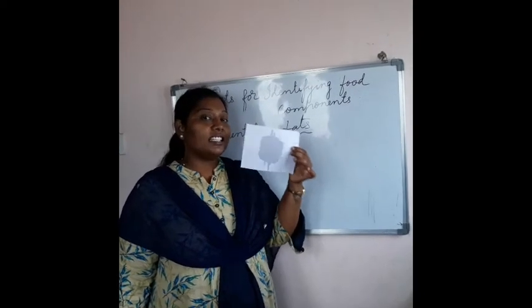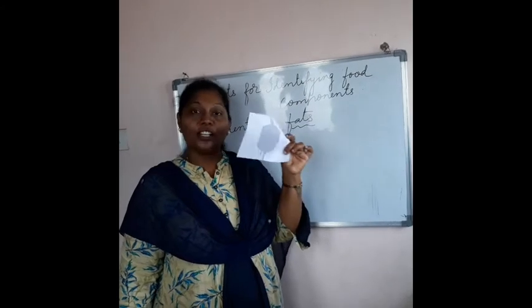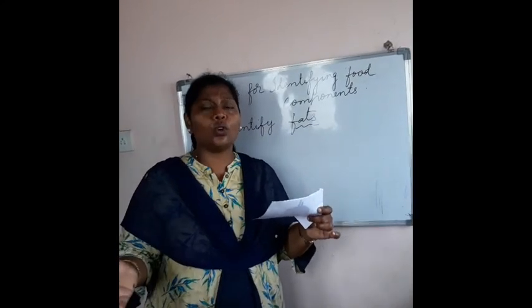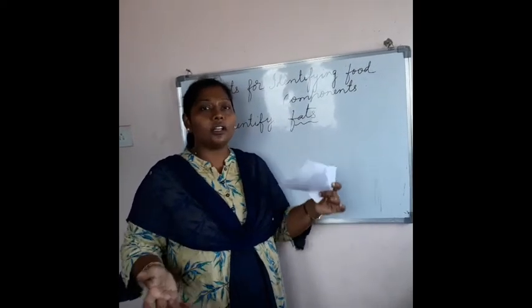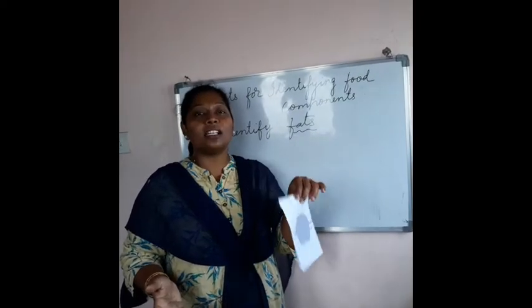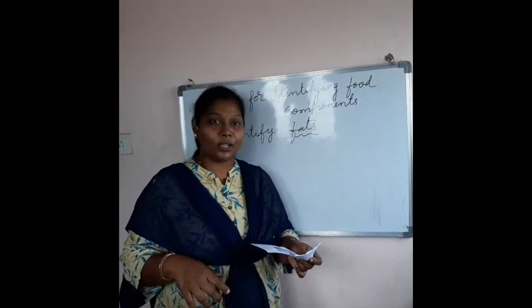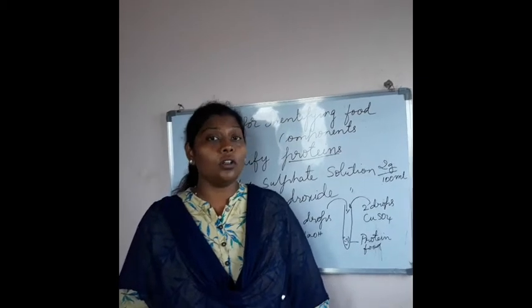Okay, you can try this test on your own at your home. This is a very easy procedure. Not only oil, you can take ghee or olive oil or coconut oil or sesame oil, any kind of oil. If you try with any of the oils, you can find the same effect. So by this we can prove that the materials are containing fats. What do the materials contain? Fats.